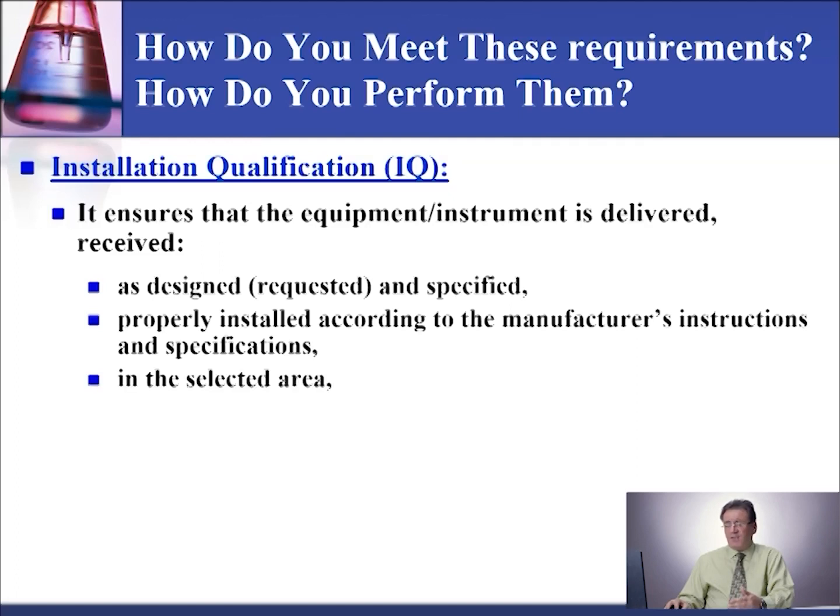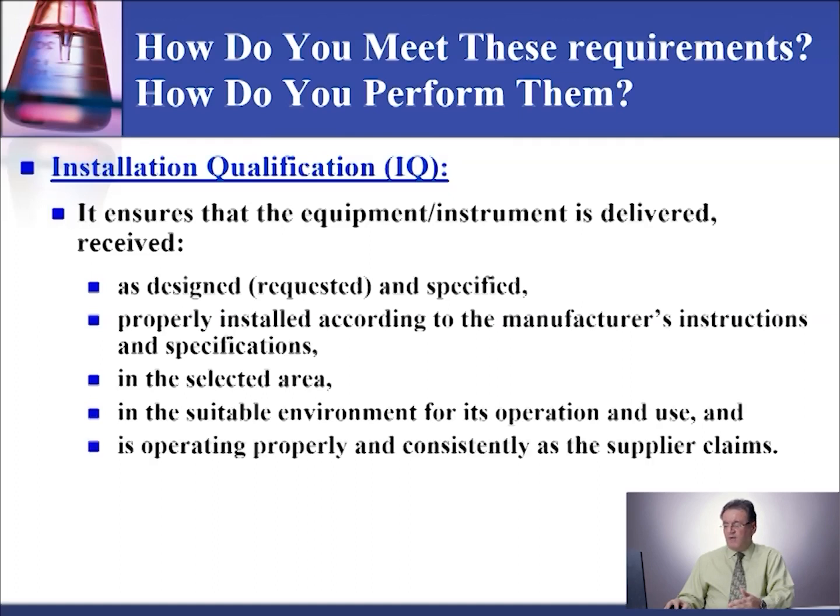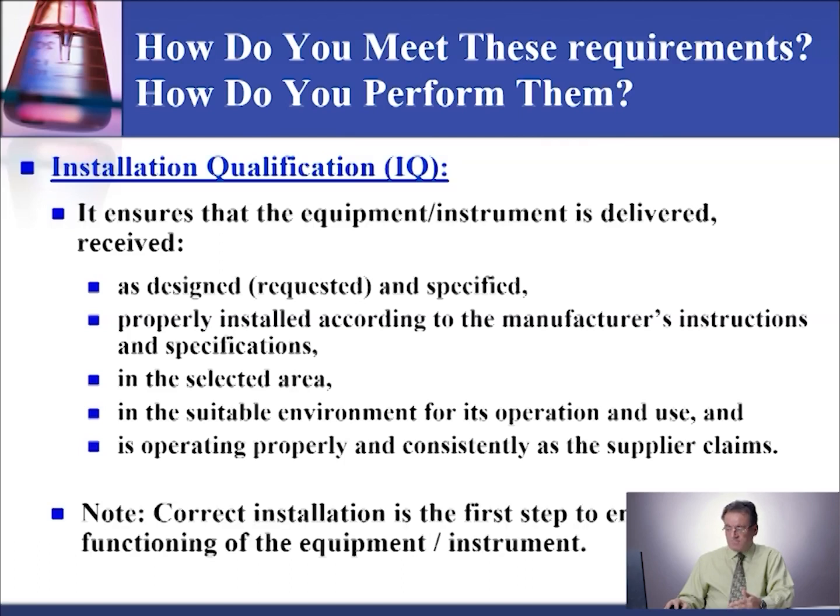For the operational qualification phase, the equipment or instrument needs to operate or work as the supplier claims. For the performance qualification phase, the equipment or instrument needs to perform and give results as needed and expected by the end user.